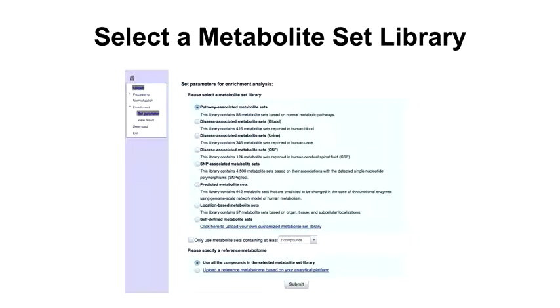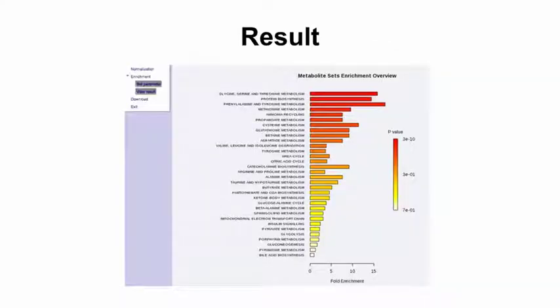From here you can select a metabolite set library from which to compare. There might be pathway-associated metabolites, disease-associated metabolites, SNP-associated metabolites — single nucleotide polymorphisms — predicted metabolite sets, or location-based metabolites, since certain metabolites are found in certain tissues or biofluids. You can also create your own metabolite set — for example, one you know is important in cancer or cachexia. There are others compiled for this particular application as well.